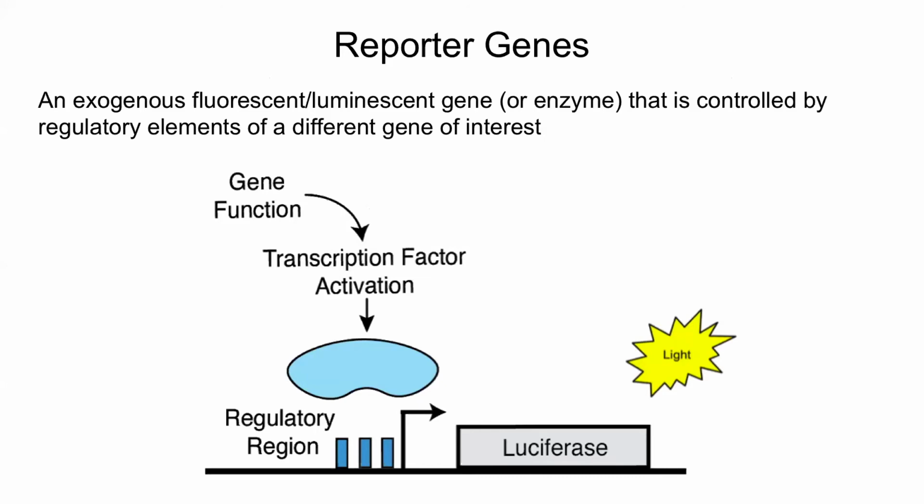Great. The idea around transcription-based methods is just that you can link the fitness of your gene or your library to the quantitative expression of some external transcript, and then you perform RNA-seq and you can look at the relative transcript levels and correlate that back to a variant activity score.